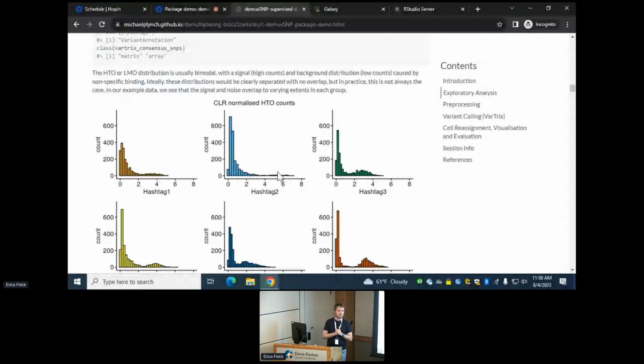I wonder if you could combine this with CRISPR, like for CRISPR perturbations in single cell RNA. If you use a cutting site, for some of the CRISPR experiments, combined with a hashtag. It's the same person throughout the different hashtags, but different CRISPR conditions. If you have a strong signal there, then you potentially could. It's not something I know a massive amount about. It's not something we've actually tried, but it's a possibility, yes.